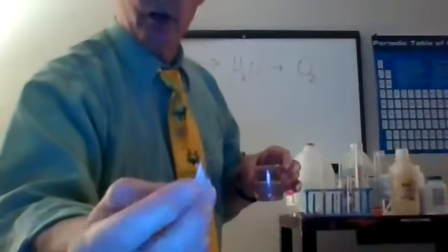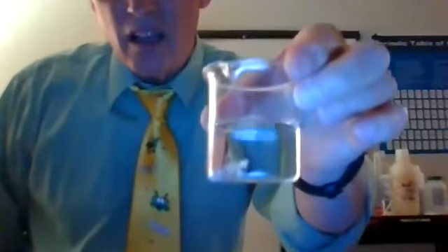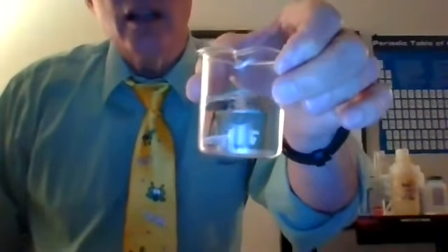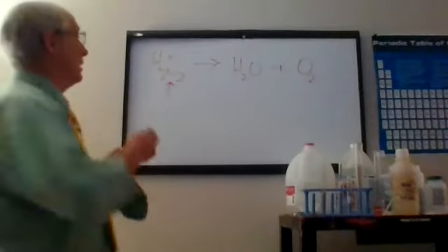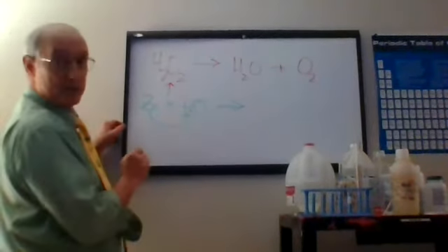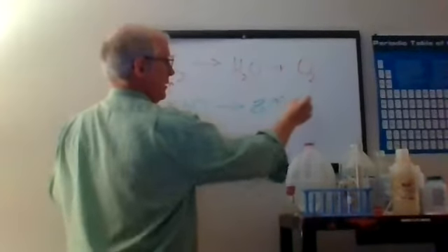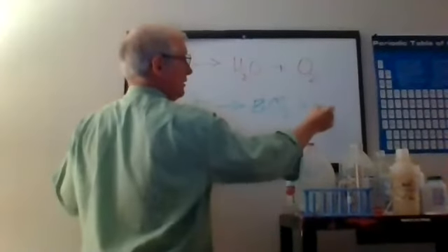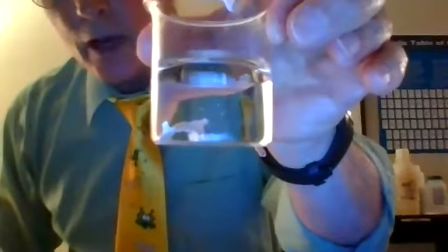Let's take a little piece of zinc. Right there. That's called mossy zinc. And we're going to put it in here, and I want you to watch the reaction. There's not a whole lot of reaction. Normally with zinc and hydrochloric acid, what happens is the zinc displaces the hydrogen. And so you get zinc chloride, and the hydrogen goes and dances by itself. Okay, so let's see again. Do you see any hydrogen dancing by itself coming off of that reaction?